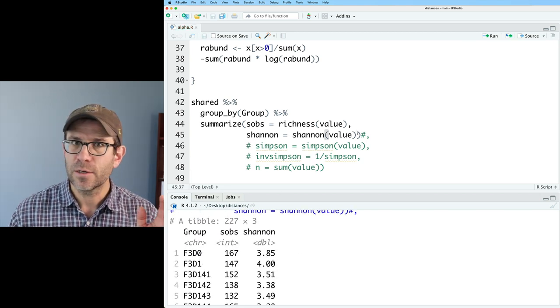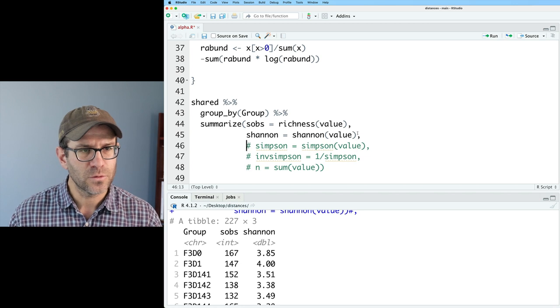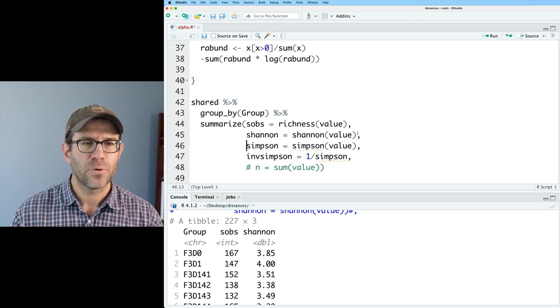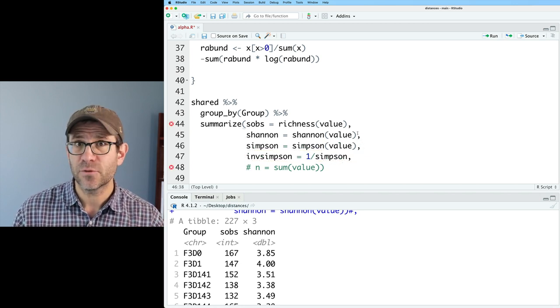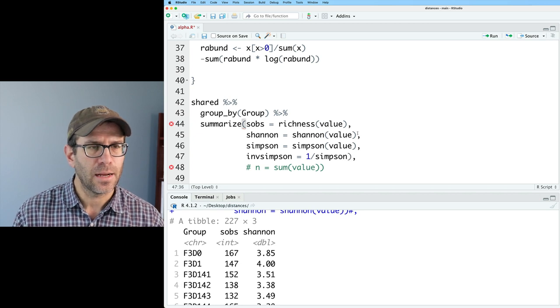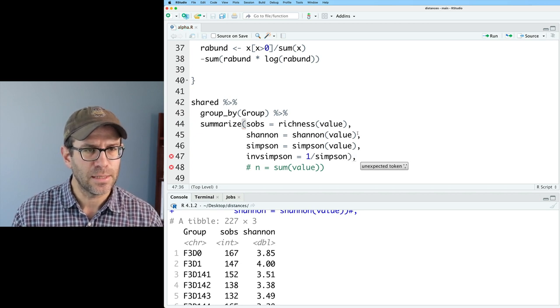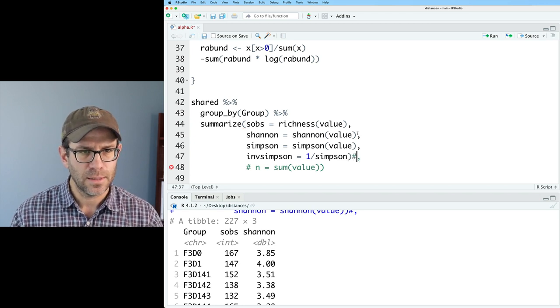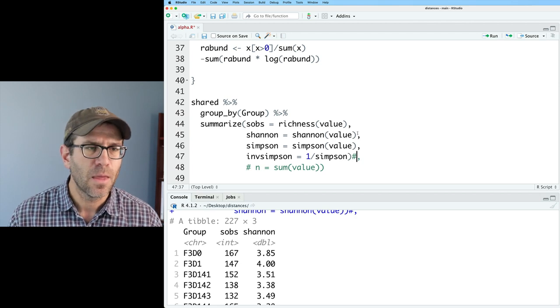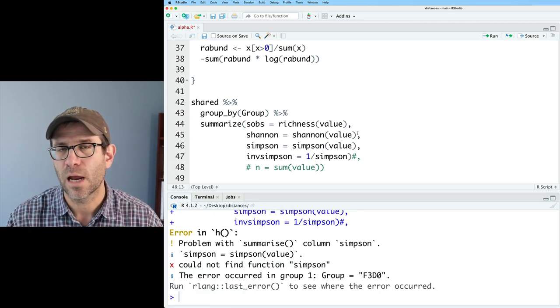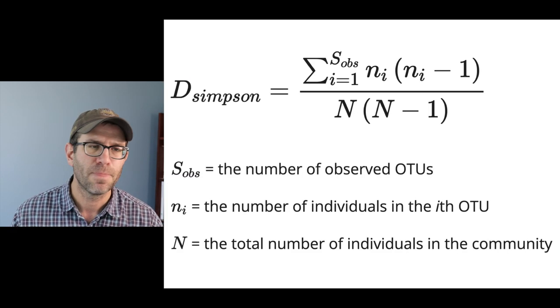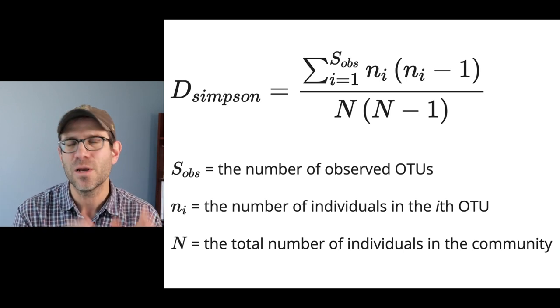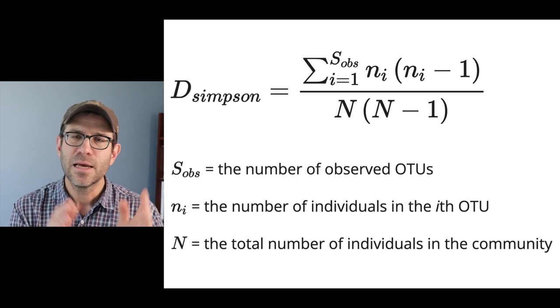So the next thing I want to do is go ahead and remove those comments so that we are presenting the Simpson and inverse Simpson diversity indices. And I put that close parenthesis in there and get rid of that or comment out that comma. And of course, this doesn't work because we don't have the Simpson function loaded quite yet. So again, I'm going to encourage you to write your own Simpson diversity index.